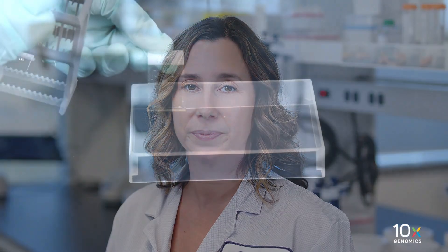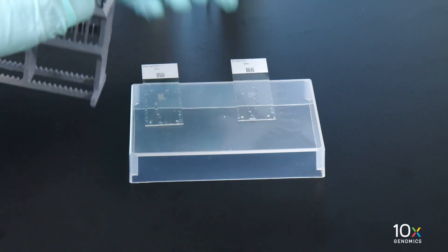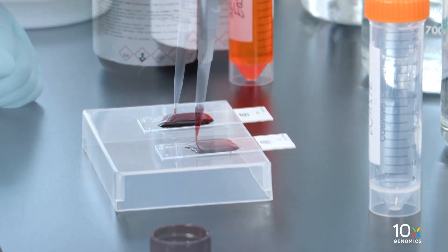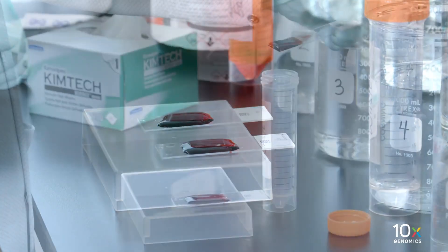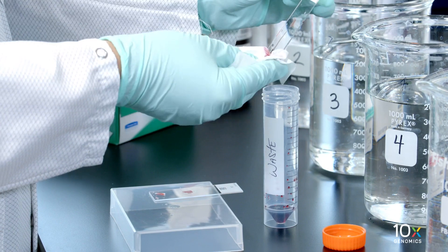We are ready to stain the tissue with hematoxylin. Place the slides on a flat, clean, non-absorbent work surface. Some residual droplets may remain. Add 1 milliliter of hematoxylin per slide to uniformly cover all tissue sections. Incubate for 3 minutes at room temperature. Discard the reagent by draining and/or holding the slide at an angle, with the bottom edge in contact with a laboratory wipe.